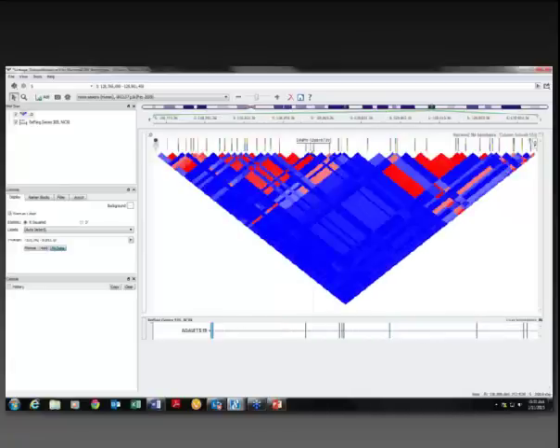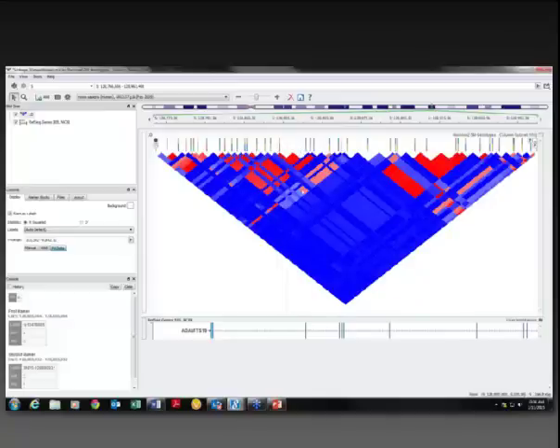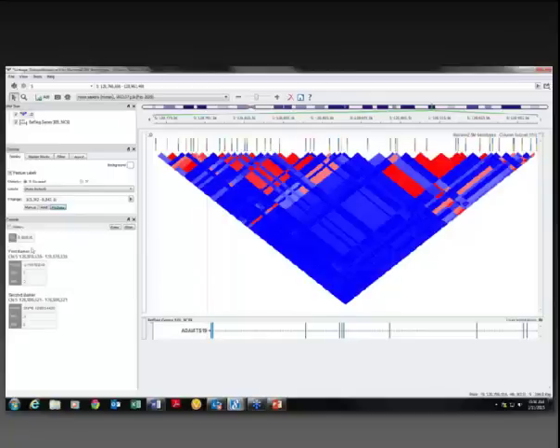In SVS, we have the ability to click one button and start to see LD patterns across a genomic region. Each vertical bar across the top represents a particular SNP, and in the triangular, colorful plot below, we have a representation of linkage disequilibrium. Red colors indicate strong relationships where you can pretty well predict the alleles at one SNP based on observed alleles at another. Blue indicates a lack of that correlation structure. Clicking on a block tells me which two SNPs I've selected and the strength of the LD relationship — in this case, an R-squared of about 96%.